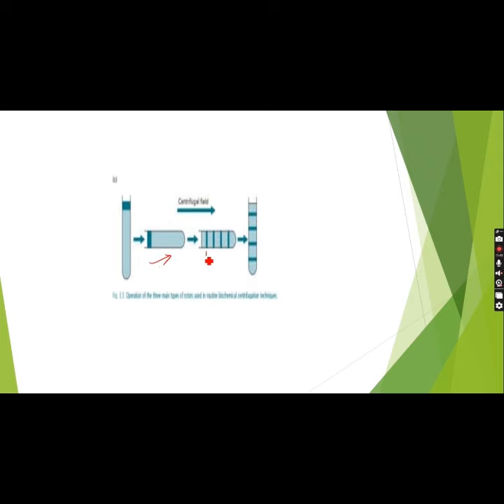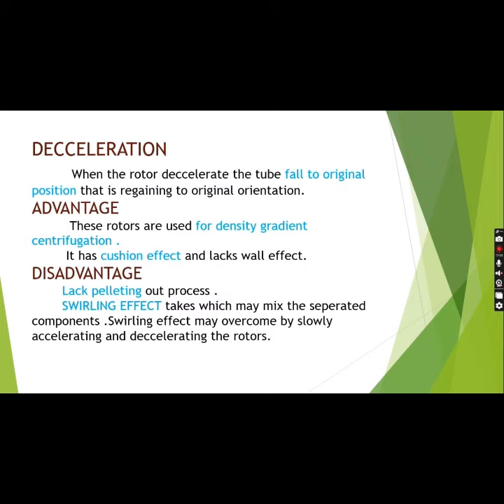During this period itself, different types of compounds are sedimented based on their density. So in general, it is involved in density gradient centrifugation, which means different compounds, that is, different components or cell components, can be separated in this swinging bucket rotor.